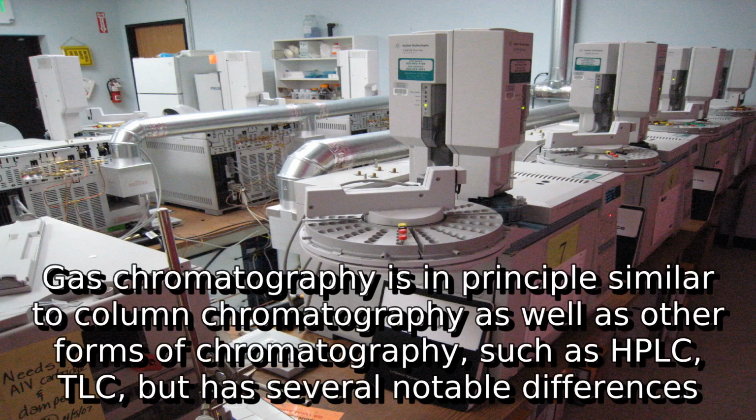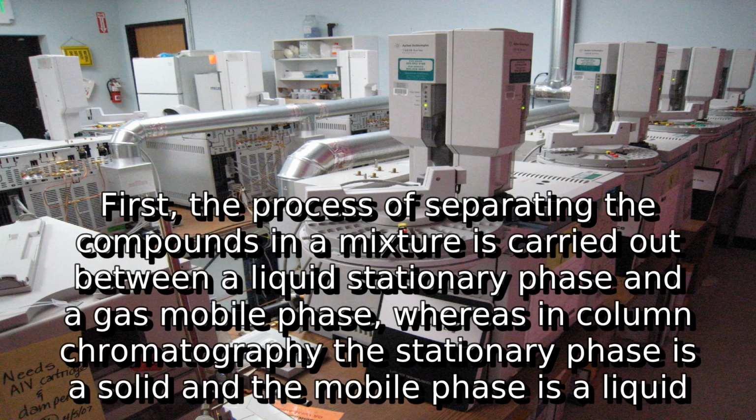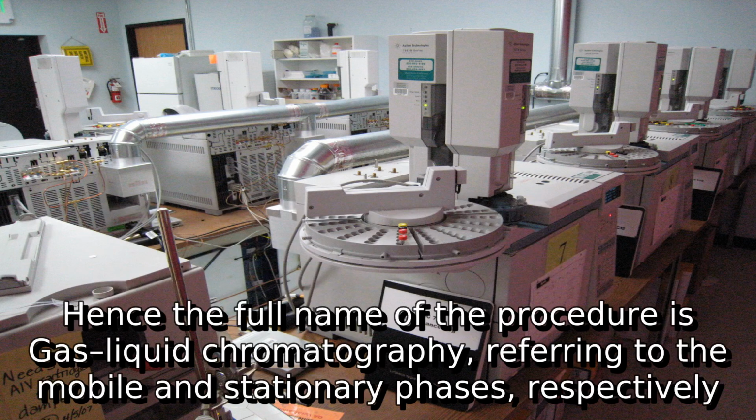Gas chromatography is in principle similar to column chromatography as well as other forms of chromatography, such as HPLC, TLC, but has several notable differences. First, the process of separating the compounds in a mixture is carried out between a liquid stationary phase and a gas mobile phase, whereas in column chromatography the stationary phase is a solid and the mobile phase is a liquid. Hence the full name of the procedure is gas-liquid chromatography, referring to the mobile and stationary phases, respectively.